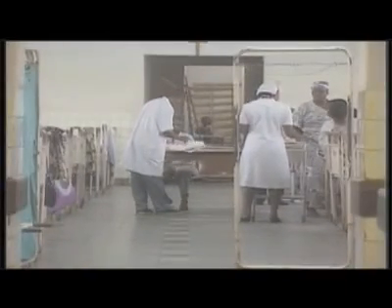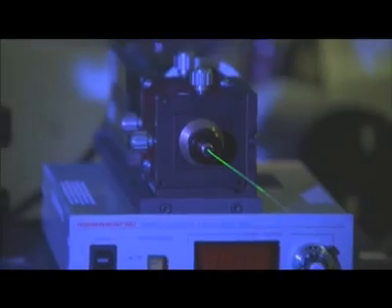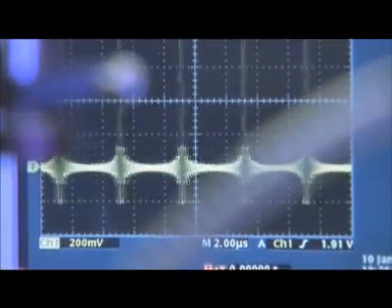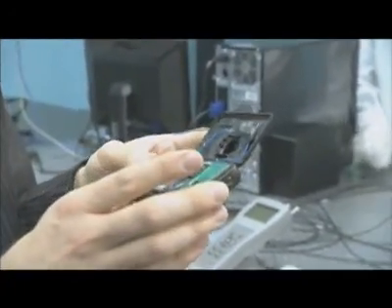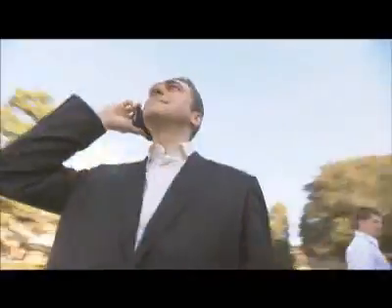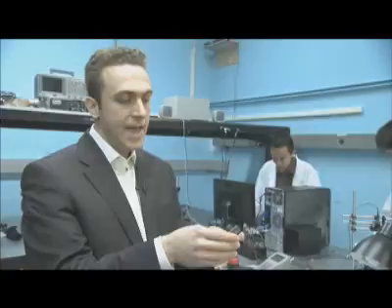So Ozcan came up with the idea of using the digital camera sensors that are found inside something that millions of people carry with them every day. "So this is the cell phone, okay? And I'll open its case here. Cell phones are everywhere. Even in Africa, almost 20% of the population uses cell phones actively. And we can actually capture that image with just a cell phone as you use it and wirelessly transmit that to a PC station. The results will then be sent back as a text message." A text message that could save lives.